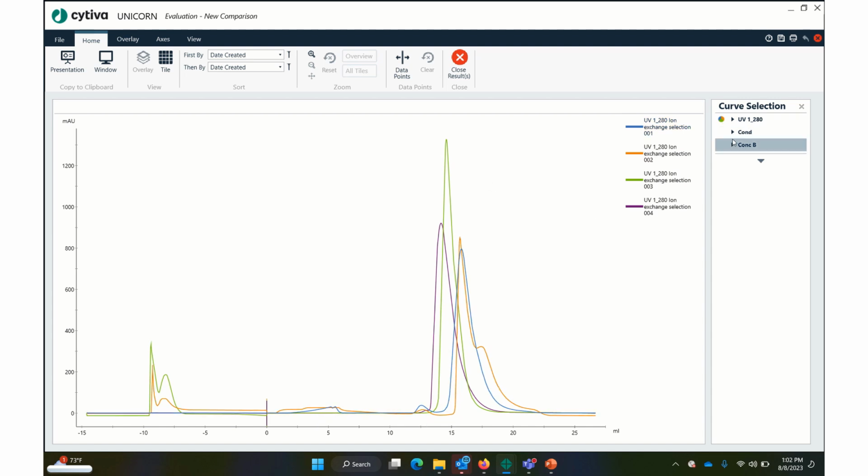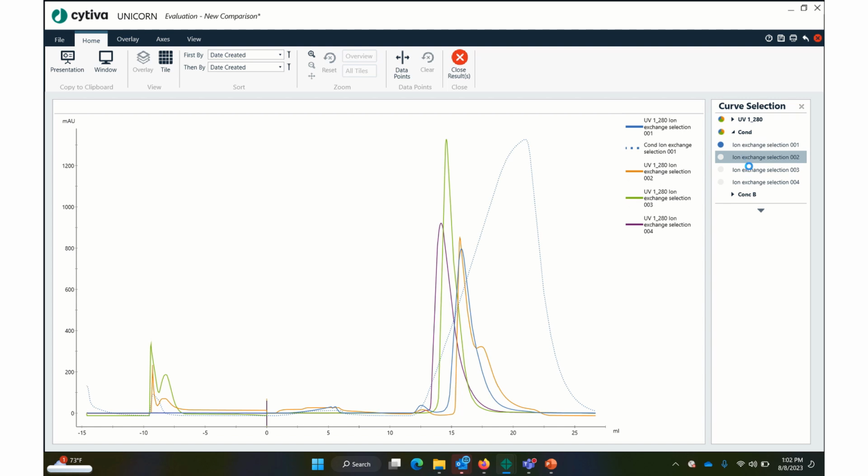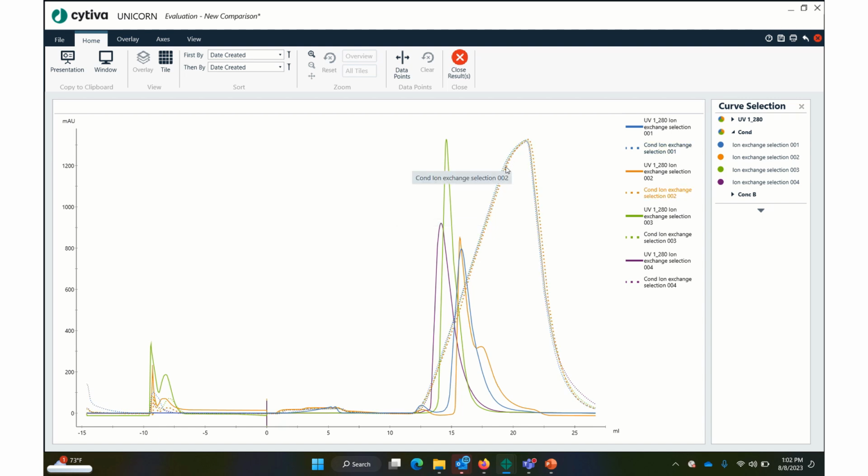First, let's check the conductivity curve. We want them all to be the exact same, one right on top of the other, and that will indicate to us that the little peaks we're noticing on either side aren't artifacts, right? Okay, looking at this, I would say all 4 of these curves are good. So that means these species that we're pointing out here are different. This is something unique, and this resin is separating it, and same with this blue line right here. I'd say this is pretty good. All right, so I'm going to turn these off.